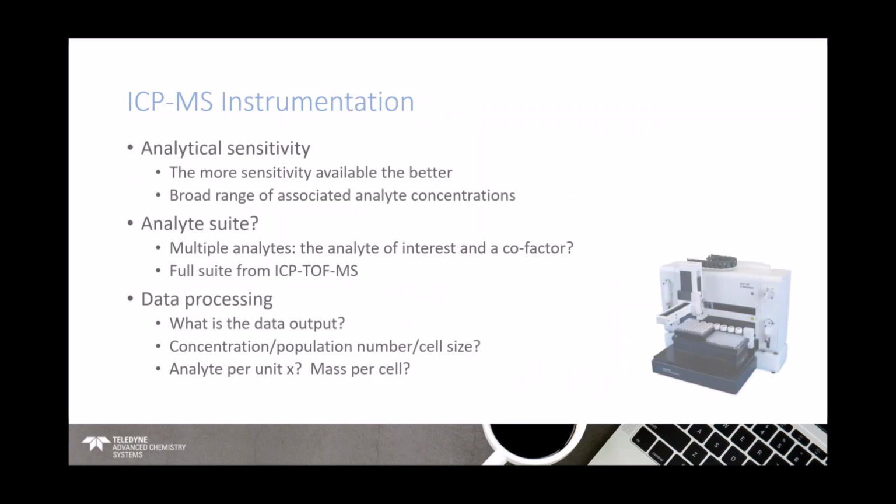So, the ICP-MS side. Like I said, over the past 20 years there's been a huge amount of development, and that's just in the time that I've been involved in ICP-MS. It's been going on long before that, but the more sensitivity that we can get for this measurement with the ICP-MS, the better.